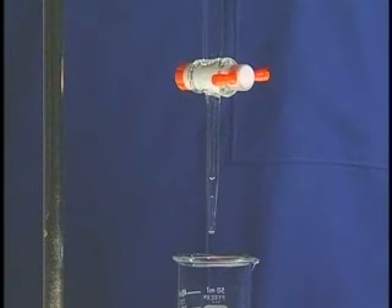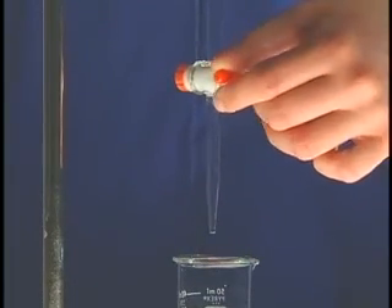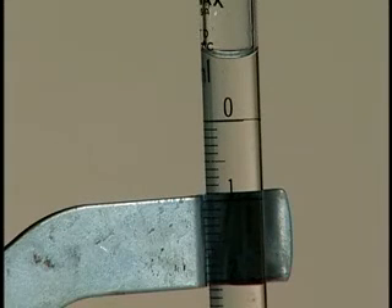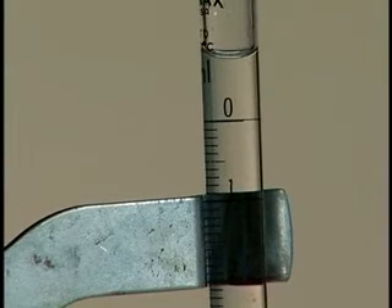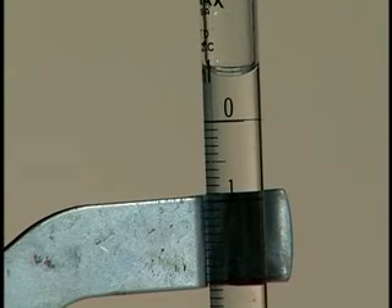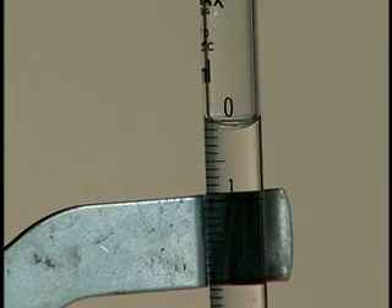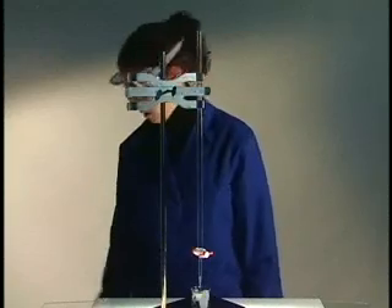Air bubbles in the tip of the burette will affect accuracy of measurement. Rapidly rotate the stopcock 360 degrees until the bubbles have been flushed from the tip. Use the stopcock to adjust the level of solution at or below the zero calibration mark. In most cases, it is not necessary to start at the zero mark. The volume of solution at this point is the initial starting point for your measurement.